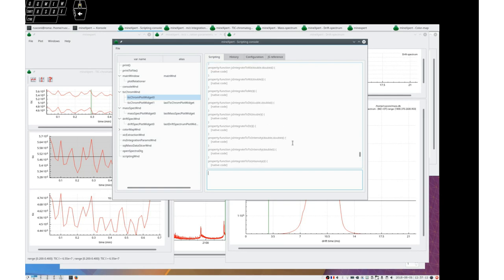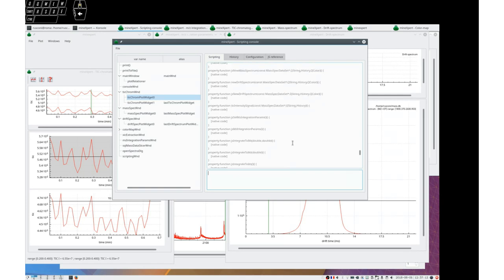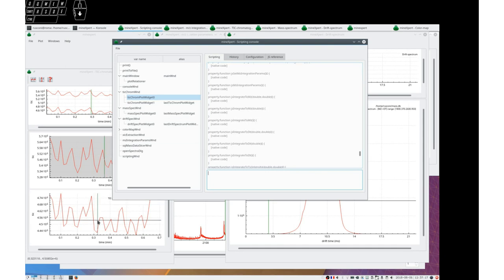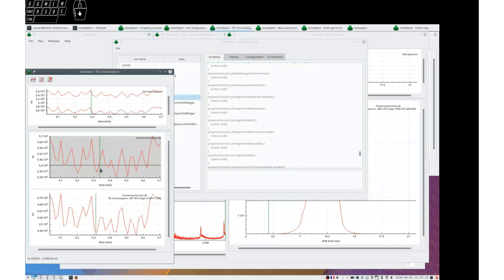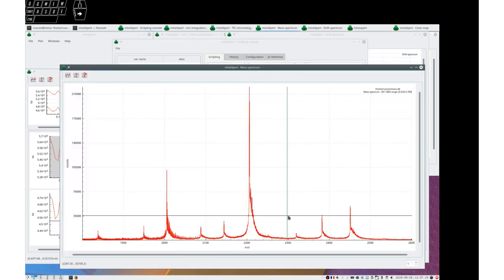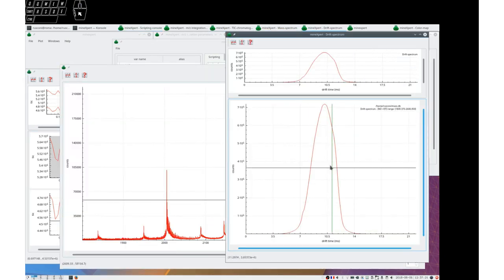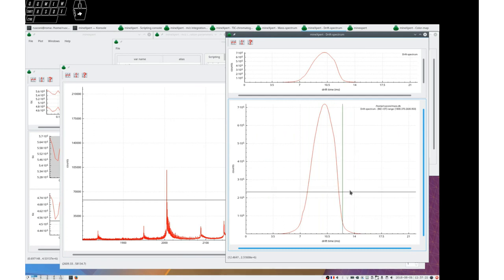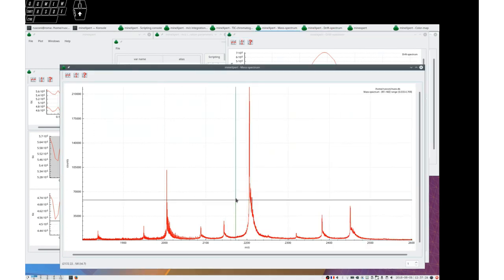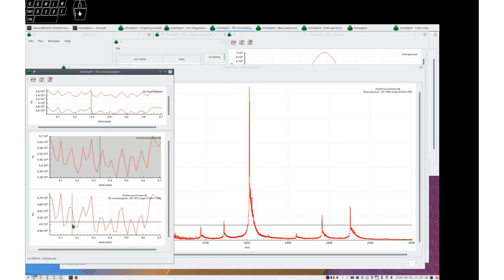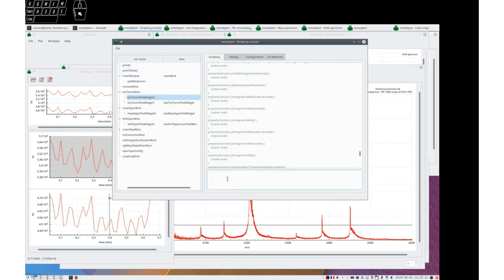What you could do, for example, is extract a trace. For example, any of these plots, be them drift time plot, MZ plot, retention time plot. All these plots may be converted to a trace.